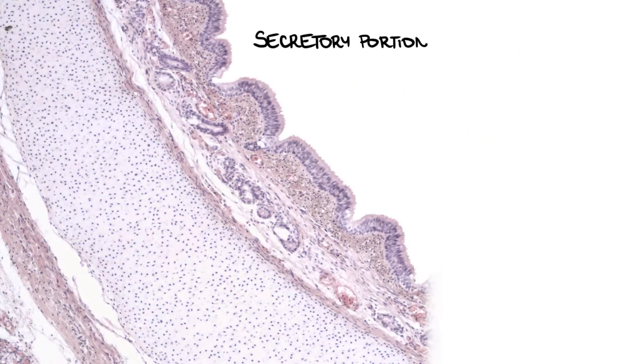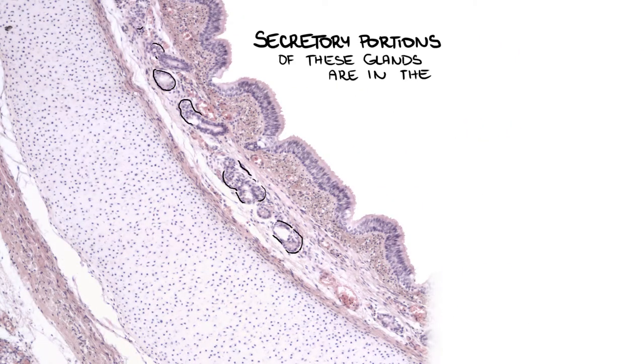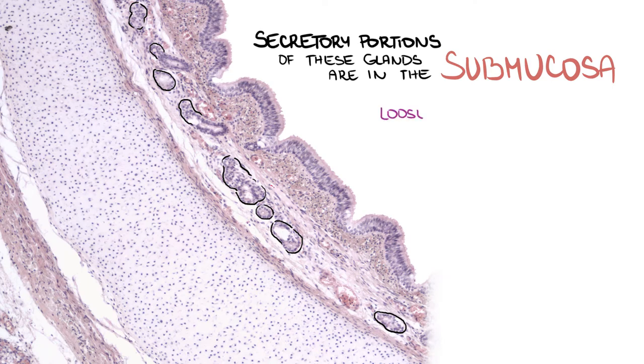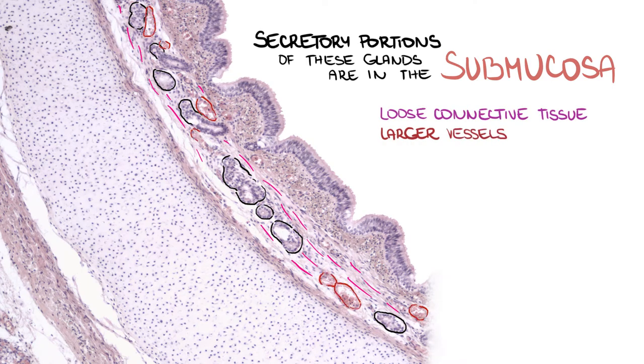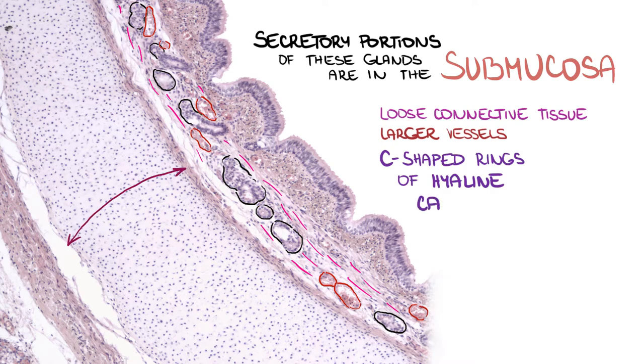Secretory portions of these glands are in the submucosa, together with loose connective tissue, large vessels, and C-shaped rings of hyaline cartilage.